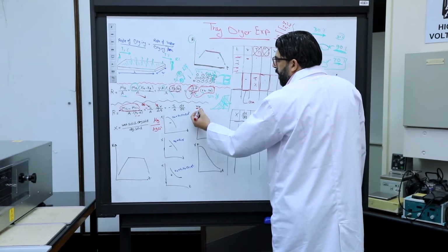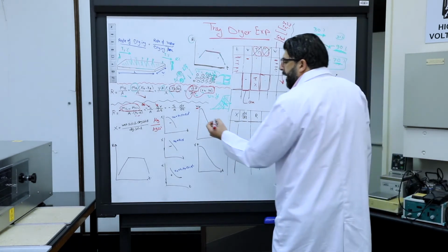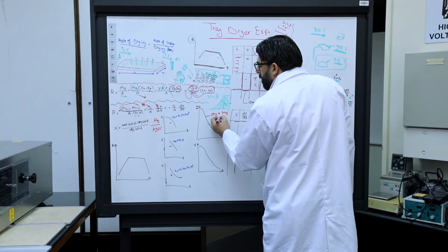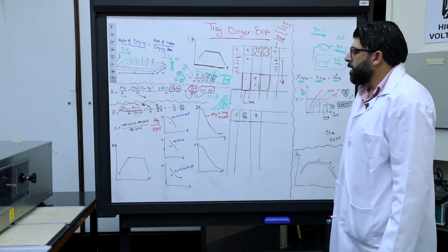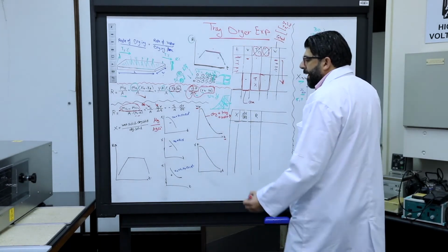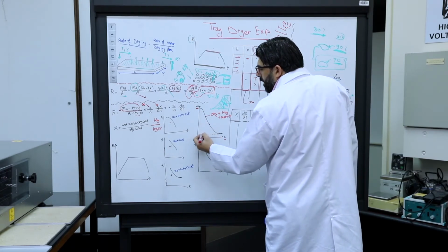So if you plot them, you have a curve like this. Okay? The weight here is the weight of dry solid plus tray plus water. And the decrease is due to the water evaporation until the weight becomes constant, so there is no decrease.